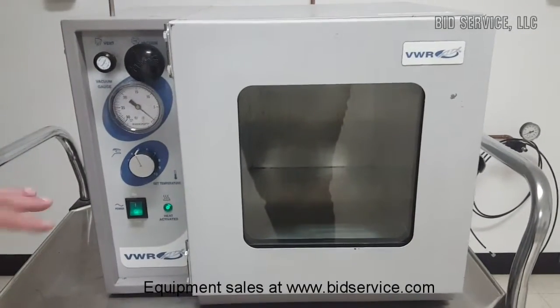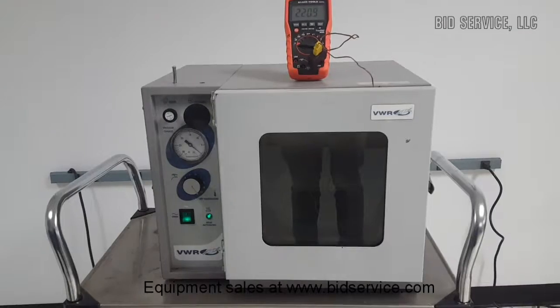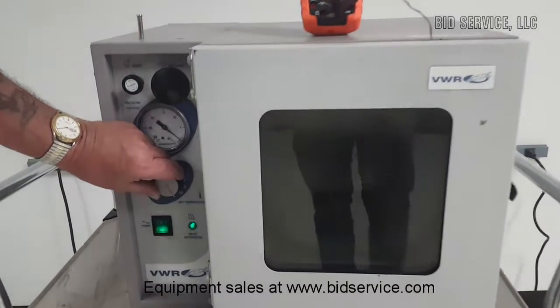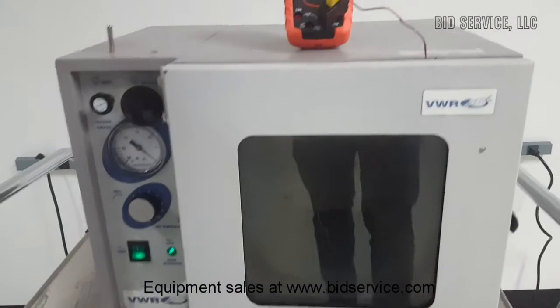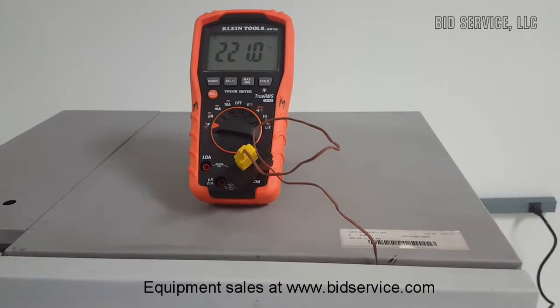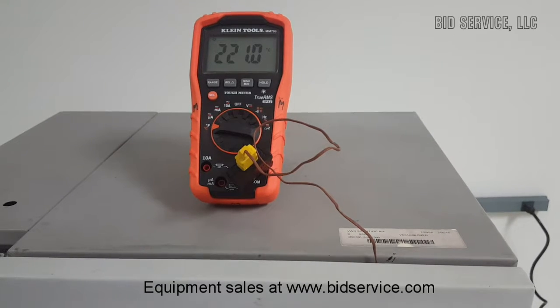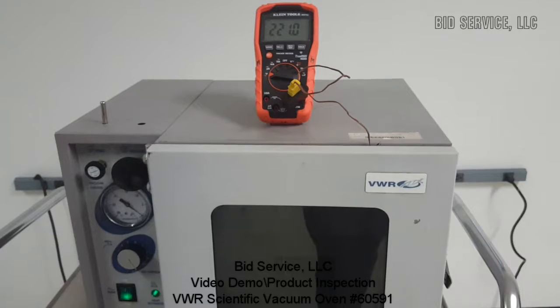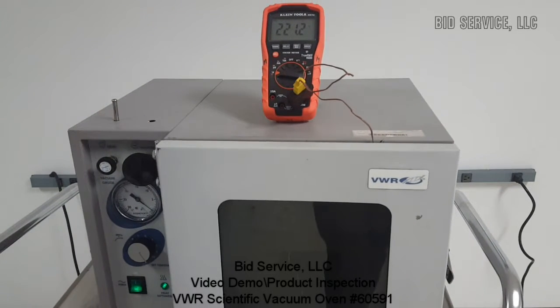I've set the temperature almost to max, and as you can see on my temperature meter, we're at 221 degrees — and it wasn't quite at max. It'll easily do 225; I've had it up there already.